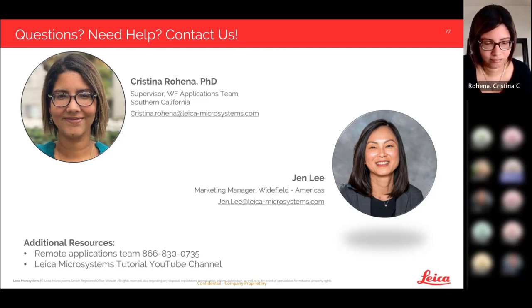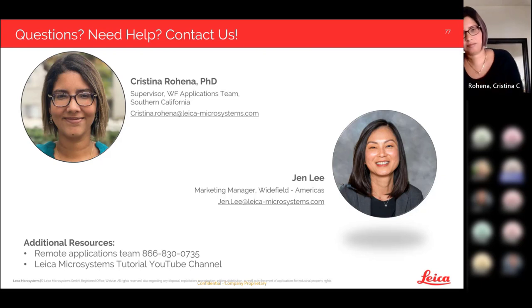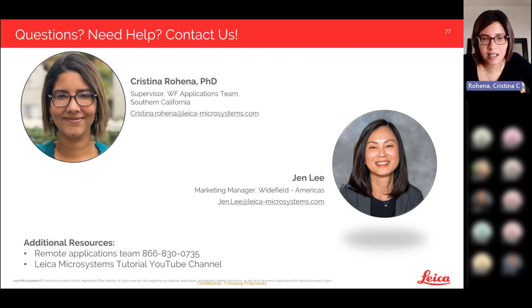First question, a very basic key question: if I already have Thunder, can I add Thunder Live to it? Yes, that's something that can be very easily done. You just need to contact us and we can easily add Thunder Live to any existing Thunder system.